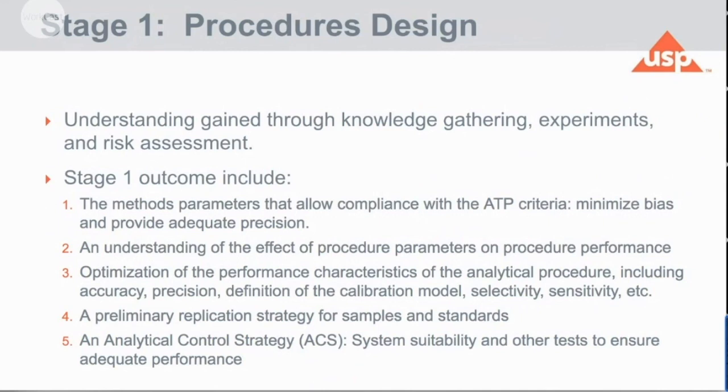element will impact heavily the way pharmacopeias are written. And finally, the control strategy. What are the things, the data, that we need to collect through the routine application of the method? Obviously, in addition to the typical system suitability requirements.